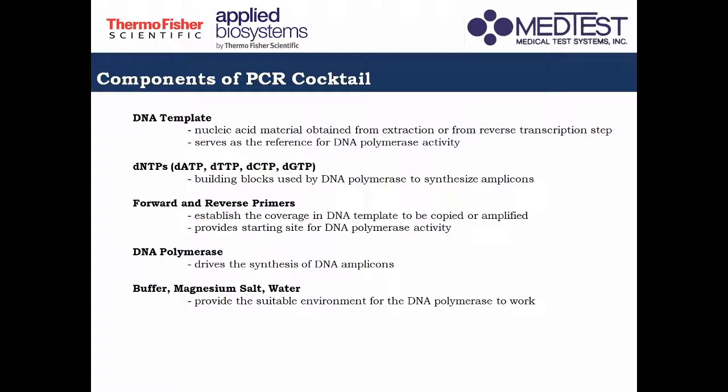Now, the most important of all is the DNA polymerase, which is the enzyme used to make the copies of the DNA. And then aside from this, we also need the buffer, the magnesium salt, and water, which provide a suitable environment for the PCR to work.